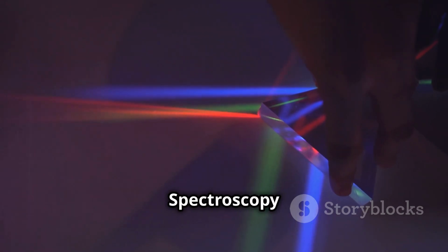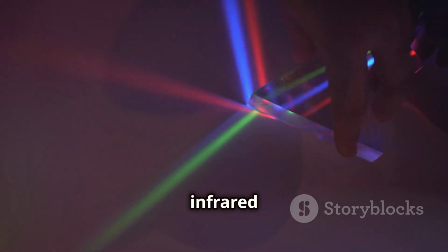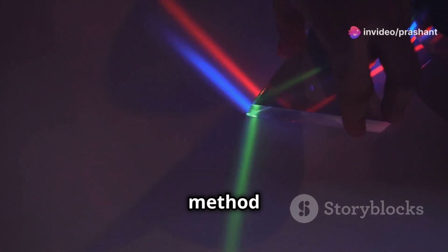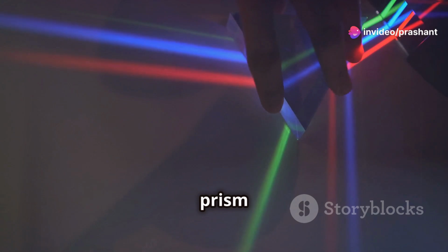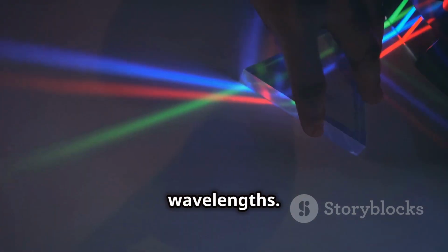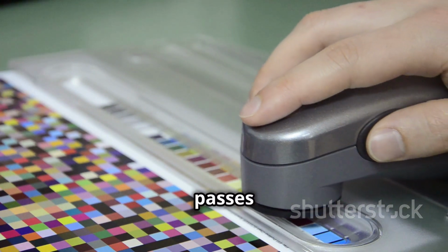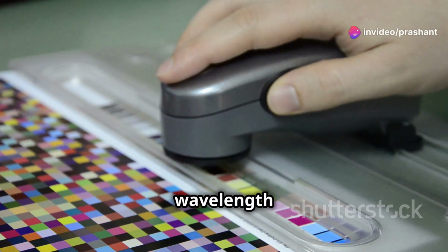Dispersive IR spectroscopy uses a prism or grating to separate the different wavelengths of infrared light like a rainbow. This method has been around for decades and is known for its simplicity and reliability. The prism or grating acts as a dispersive element, breaking the light into its component wavelengths. Each separated wavelength then passes through the sample one at a time, and the amount of light absorbed at each wavelength is measured.